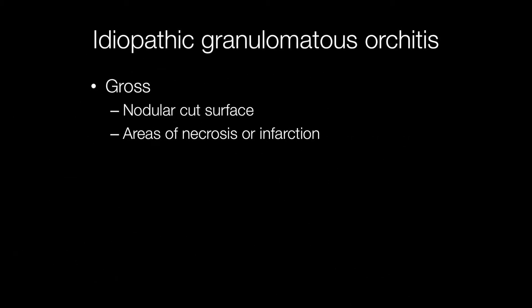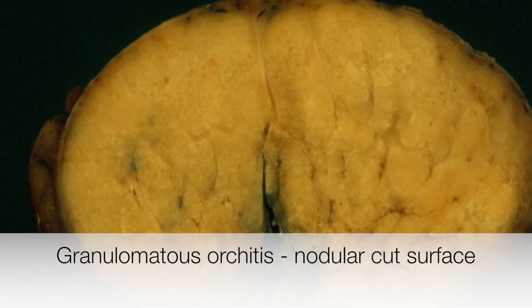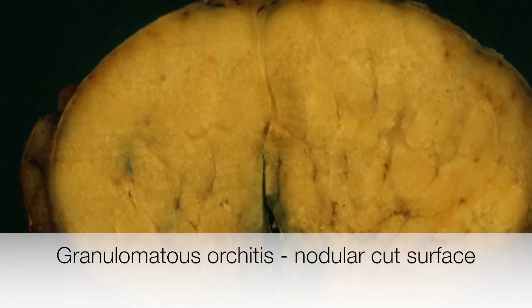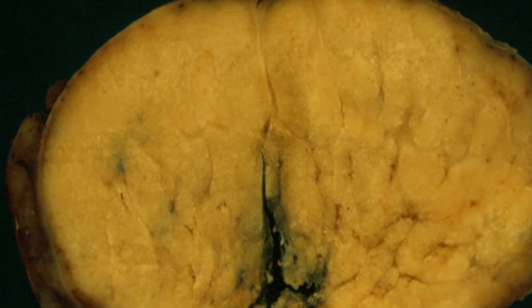The cut surface of a testis affected by granulomatous orchitis usually has a nodular appearance and there may be areas of necrosis or infarction. This testis has been bisected to reveal a rather nodular cut surface, and this is the typical appearance of granulomatous orchitis.